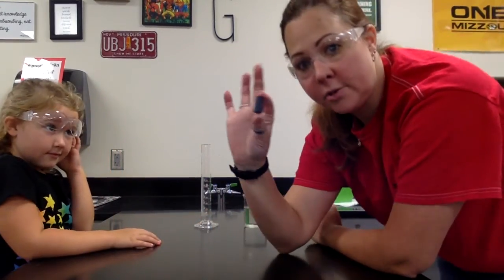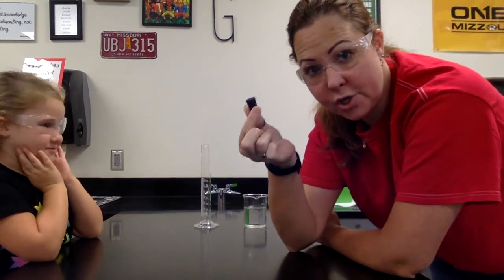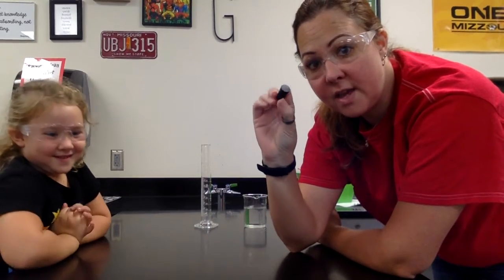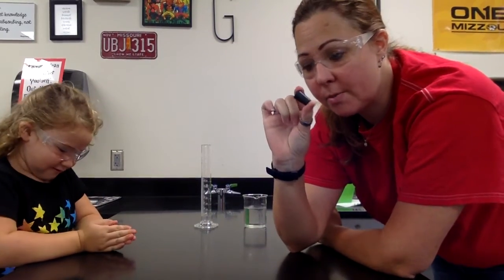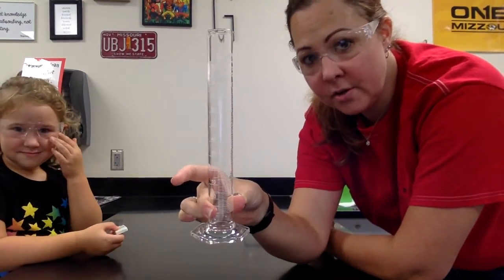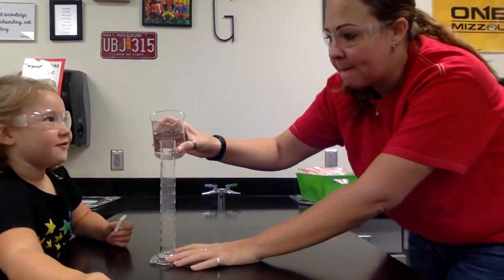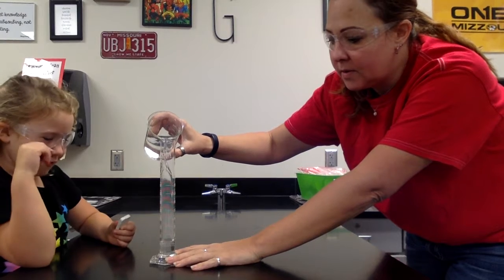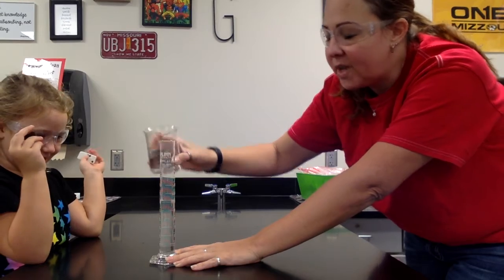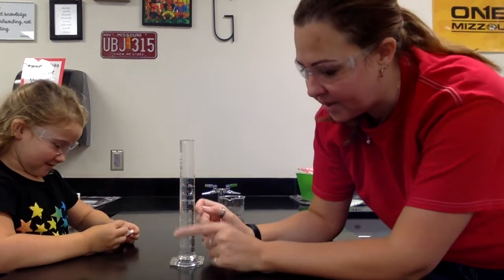Now for my irregular shaped objects like this rubber stopper, I know that we could do the geometry, but we're going to take the easy way out, and we're going to find the volume of this rubber stopper by using water displacement. So this is a graduated cylinder. We're going to put water into my graduated cylinder. Now put this inside and see if it sinks or floats. No, we're not going to see if it sinks or floats. We've used density to find out if it sinks or floats, but we're not going to do anything yet.